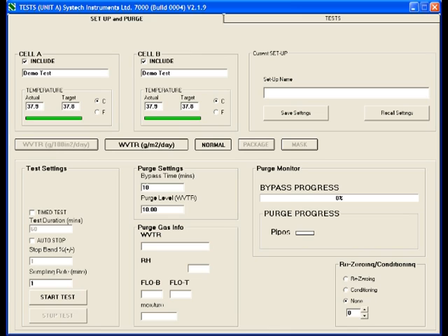Also you can give the films names, which will identify the files where the results are saved.